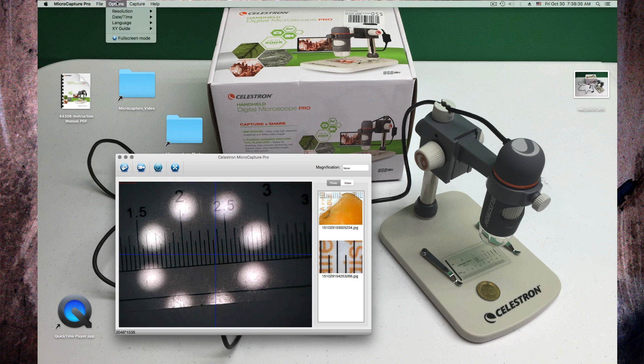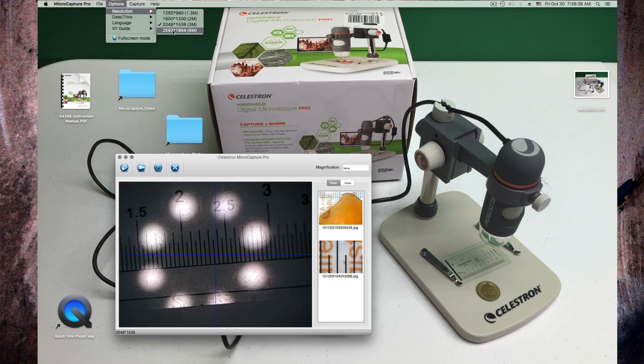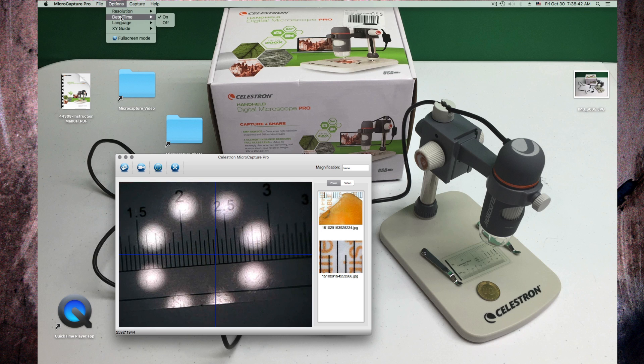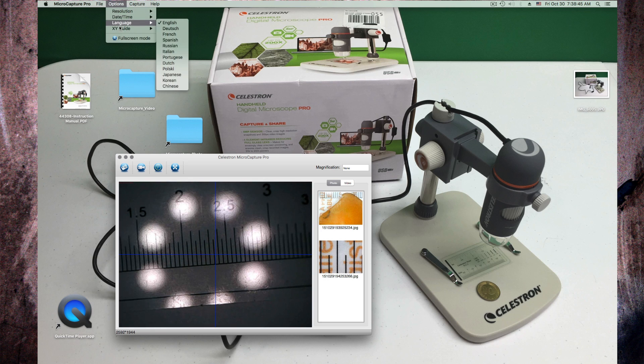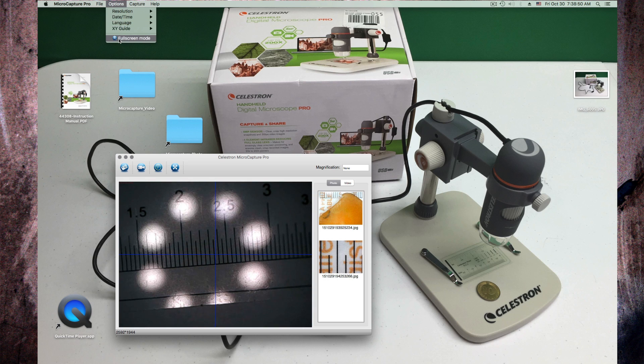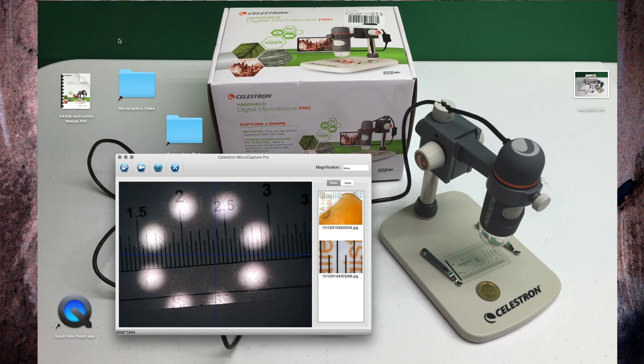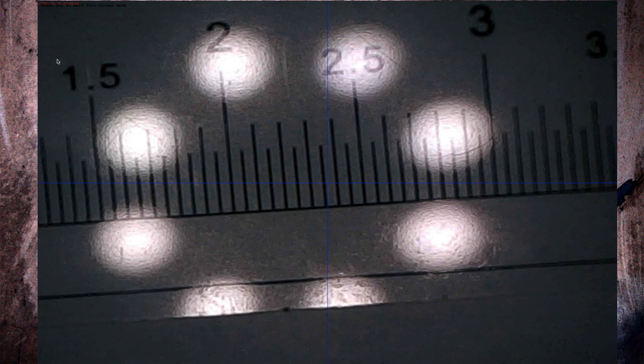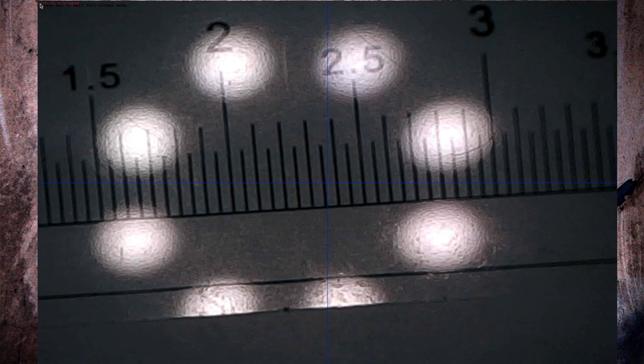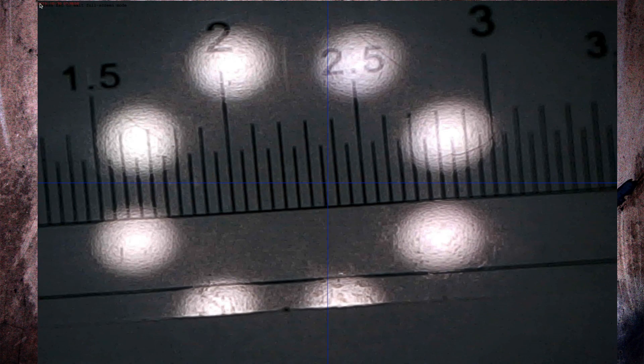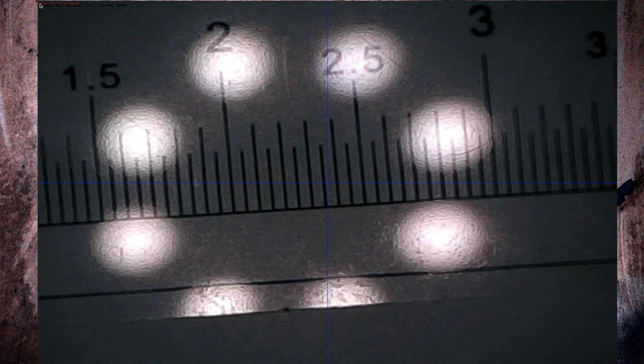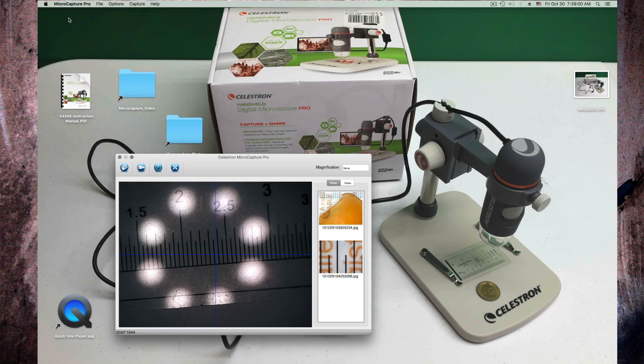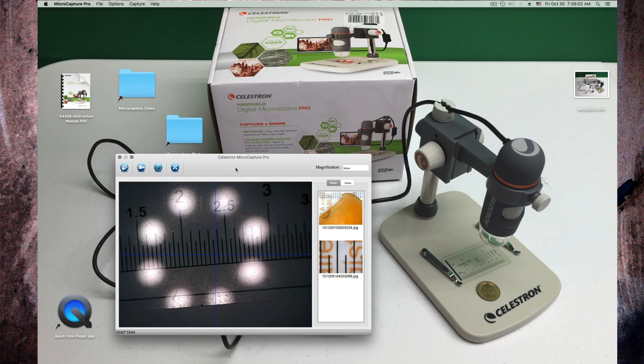So in options I can change the resolution there. I can change that the date and time is displayed, I can change the language, and I can turn on a guide. I have everything on. I can switch to full screen mode. Then I see the time and date up here.